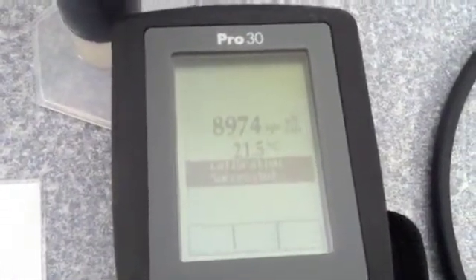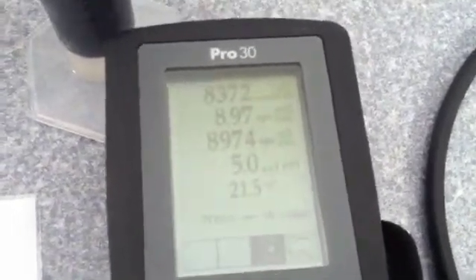We're going to hit the enter button — calibration successful. And that's all there is to calibrating your YSI Model Pro 30 conductivity meter.